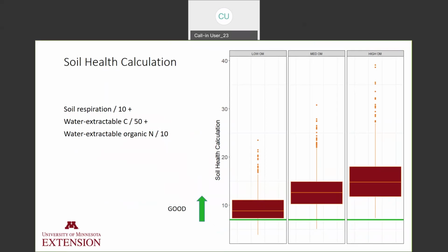And most Minnesota samples fall easily above that range, which brings home the importance of comparing your field sample to one that you take on the same soil type but with improved management, or in a natural area like a fence row. This gives you something to realistically compare your agricultural soil to, more so than this national average of 7. So there's no clear reason why you would divide these values by 10 or by 50, except just to emphasize their relative weight. A little contrary.